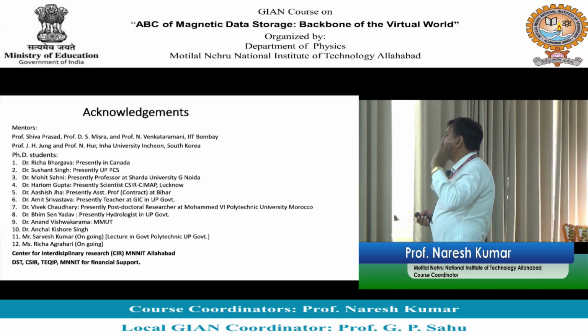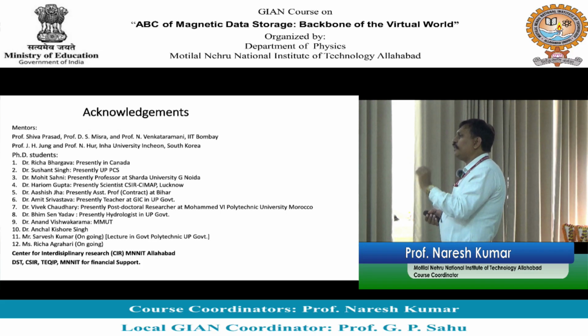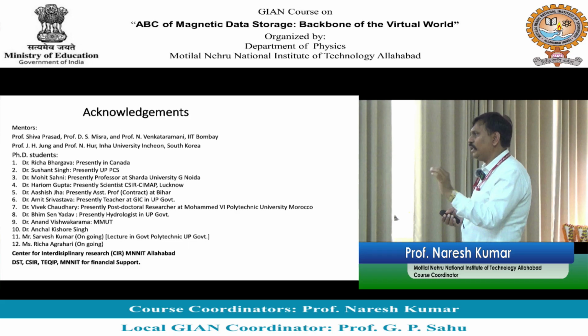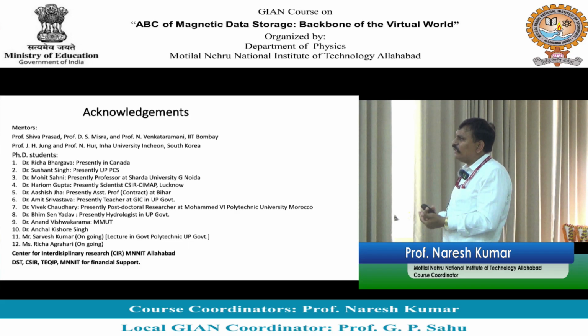So it's a destructive technique. दूसरा, sample size is very important in TEM. जो ग्रिड होती है बहुत छोटी होती है, 3 mm by 3 mm होती है. So in TEM that is very important. It's a totally destructive technique but it's very important, very powerful, महंगी भी है.